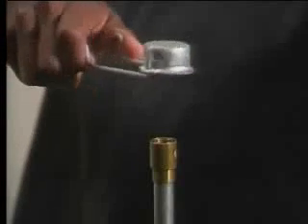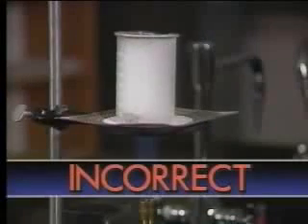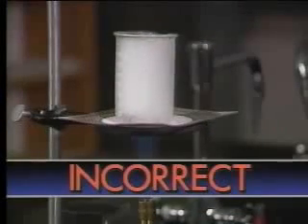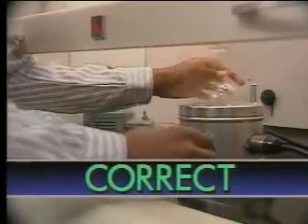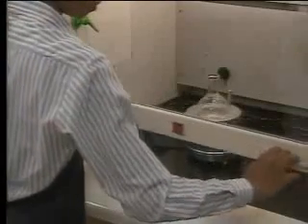The main heat source in most chemistry labs is the Bunsen burner. It produces an open gas flame burning at a high temperature. There's always the danger of an accident if it's not used properly. For example, it should never be used to heat volatile organic liquids that give off flammable vapors. These substances should be heated in a heating mantle or steam bath in a hood. But for most other substances, a Bunsen burner is an ideal heat source when used properly.